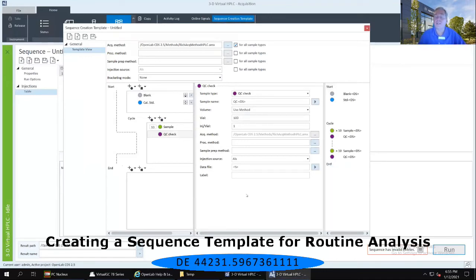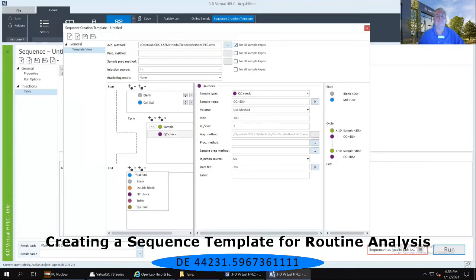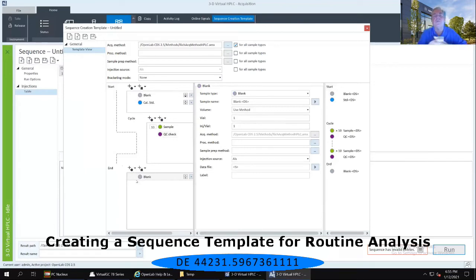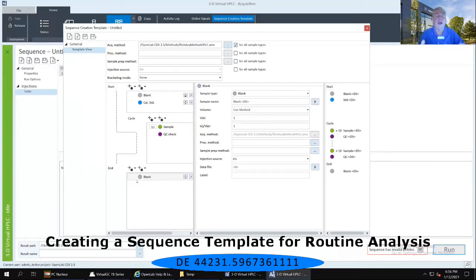Finally, according to my SOP, to make sure there's no carryover on my system once I've completed all of my injections, at the end of my run I must run another blank. On the left-hand lower panel, in the end section, use that first pull-down menu and select blank. Notice that once you do that, the middle panel automatically fills in with the information we had placed in the starting blank in the upper panel on the left-hand side. I can leave it this way and use the exact same blank vial, or I can decide to use a different one and fill in that information here.